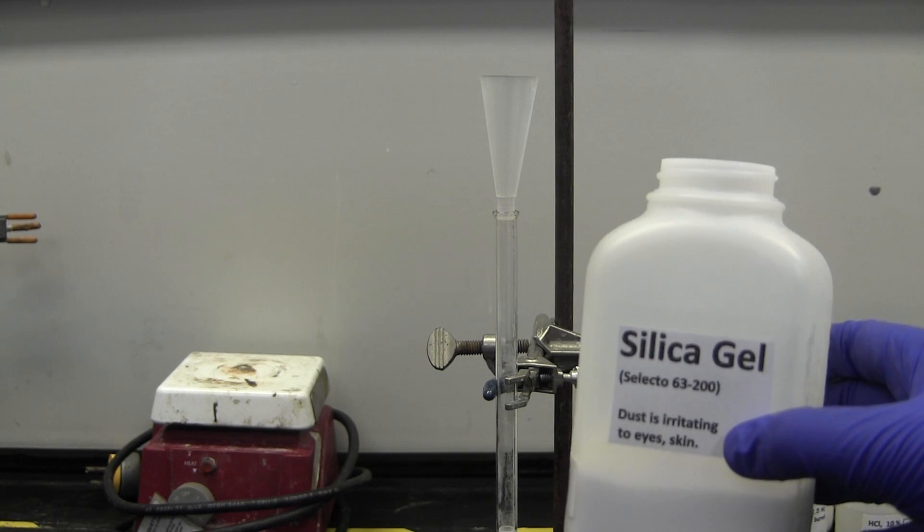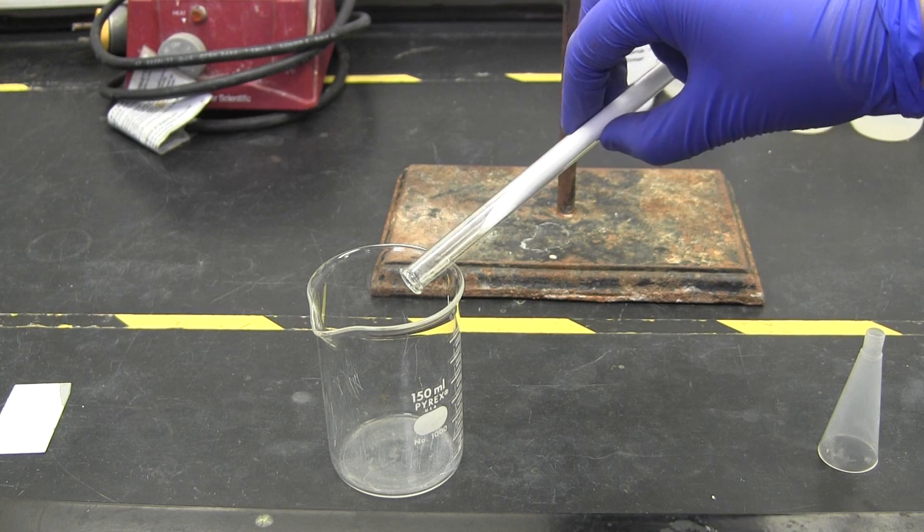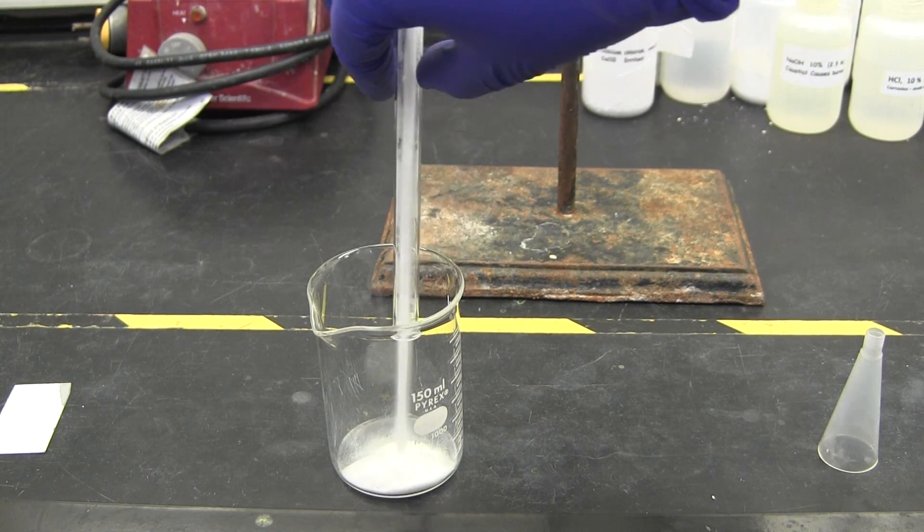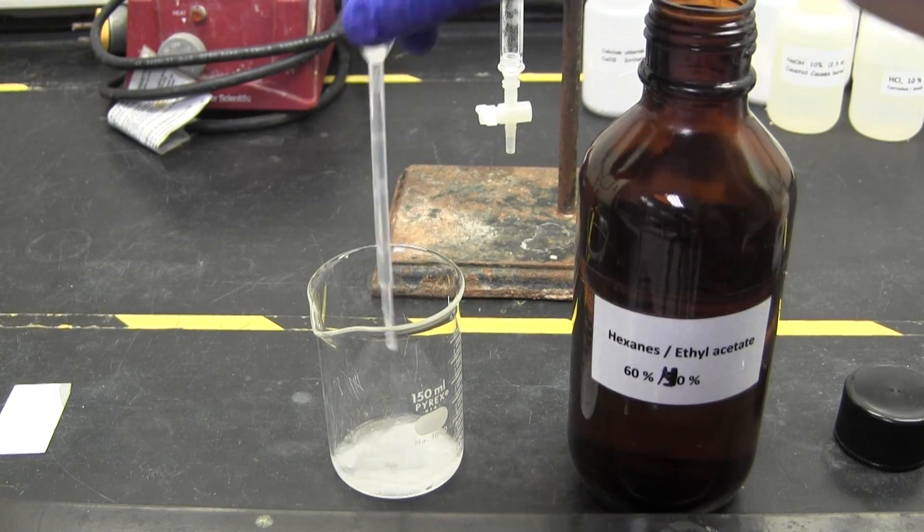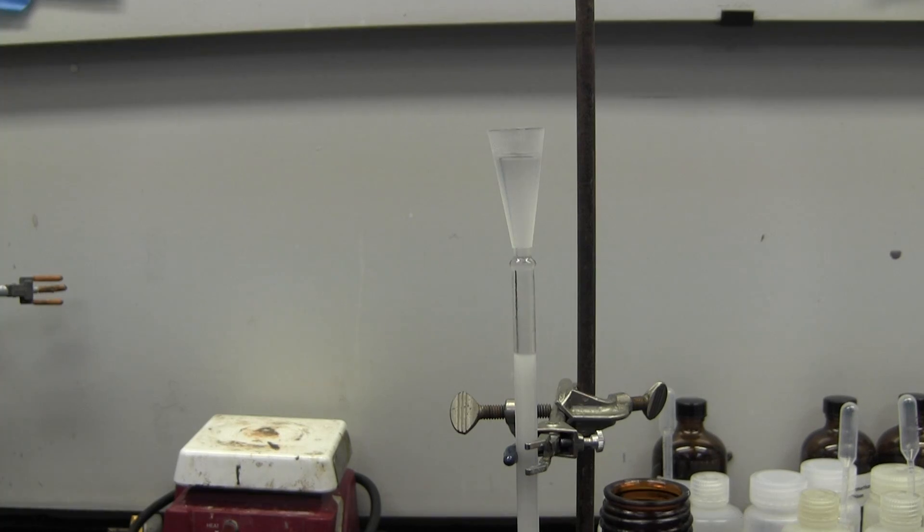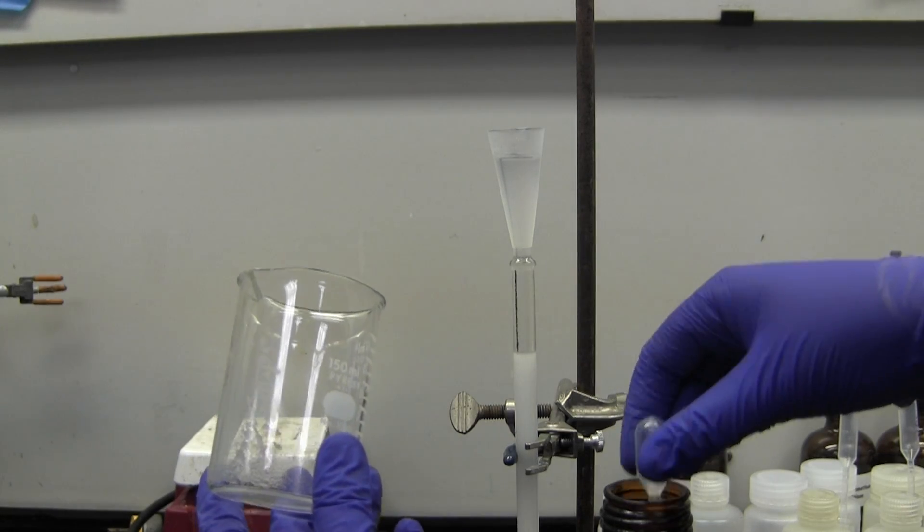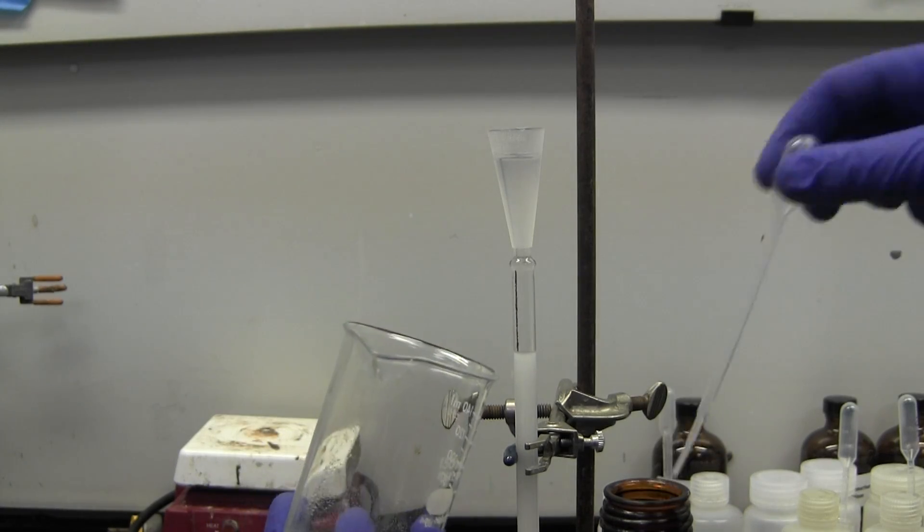Fill the column approximately two-thirds full with dry silica gel powder. Empty this into a beaker and add solvent to make a slushy-like mixture. Pour this mixture back into the column and drain off the solvent without letting the gel be exposed to air. You can use more solvent to rinse the beaker and make sure all of the resin gets into the column. This is called packing a column.